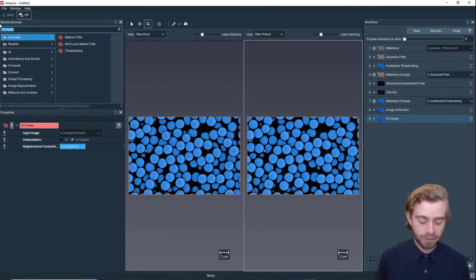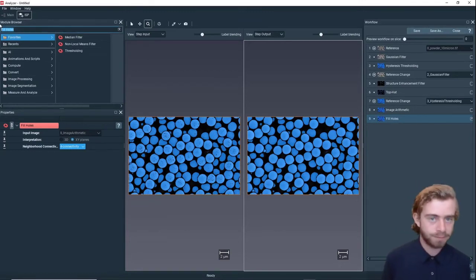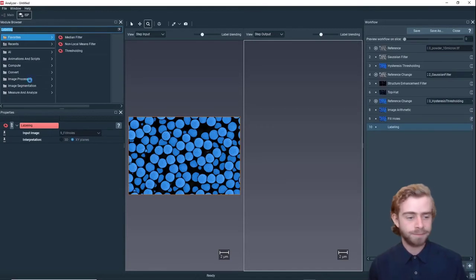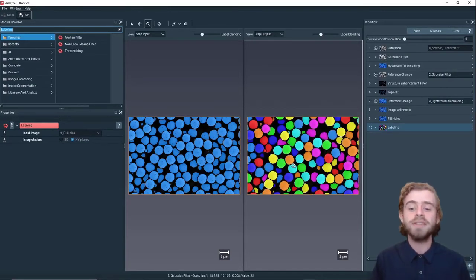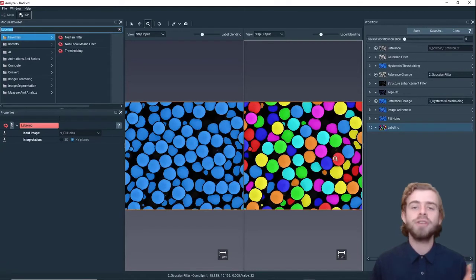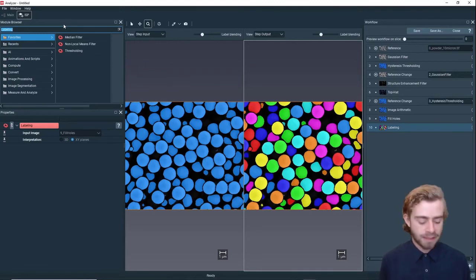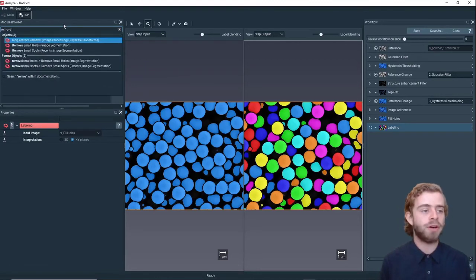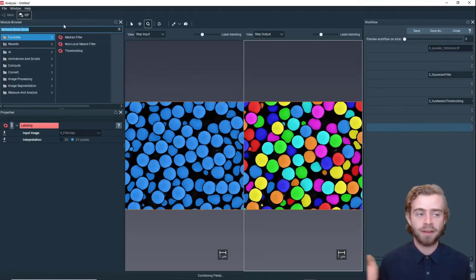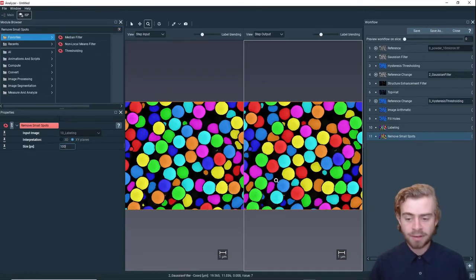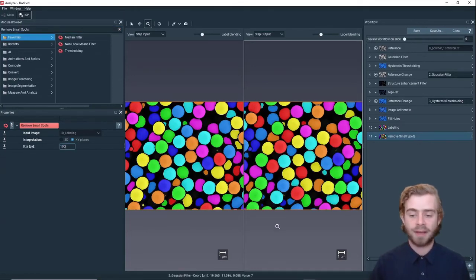This is looking pretty good. Next we're going to label each particle, so we're going to use the Labeling module and click Enter. This labels each particle as a different object. There are still some small problems — there are some really small particles that we don't want to include — so to get rid of these we're going to use the Remove Small Spots module and set the size to 100.